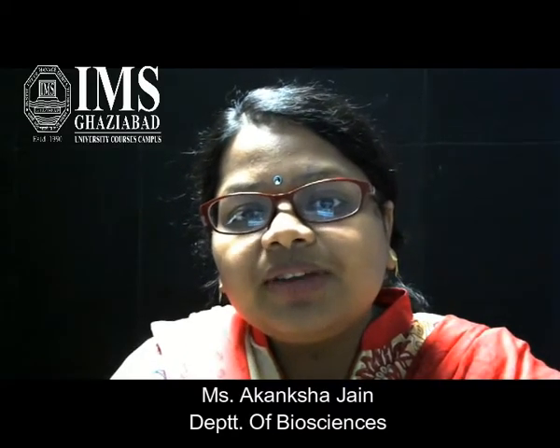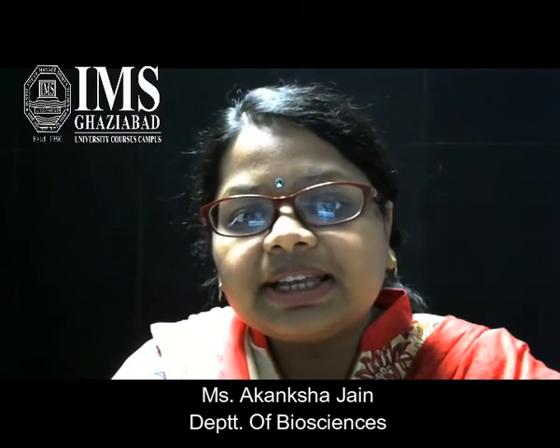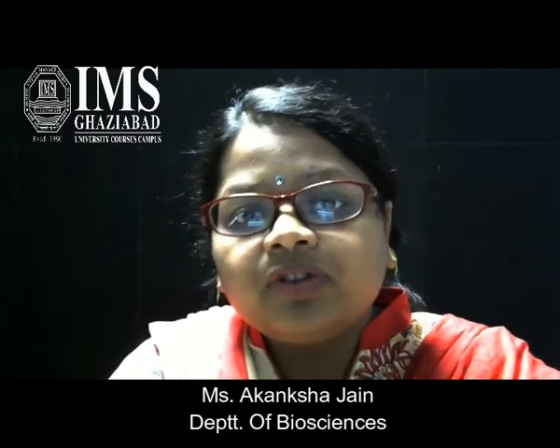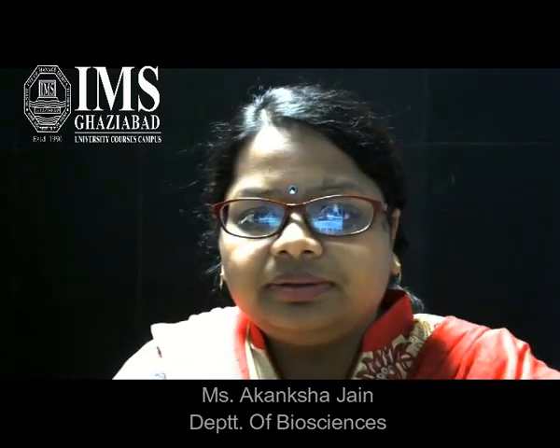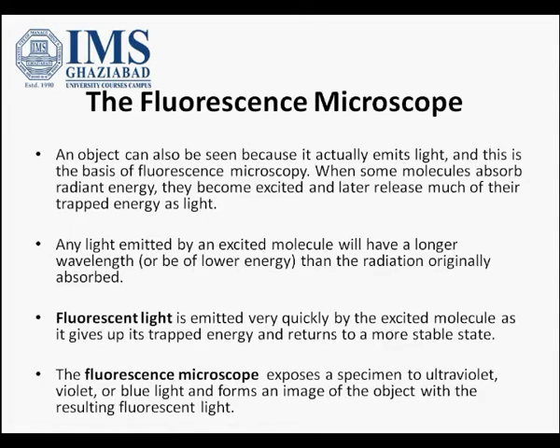Hello students, today we are going to study the basic concepts and the ray figure of fluorescence microscopy, which is an advanced form of microscopy. Fluorescence microscopy is based on the concept of fluorescence.